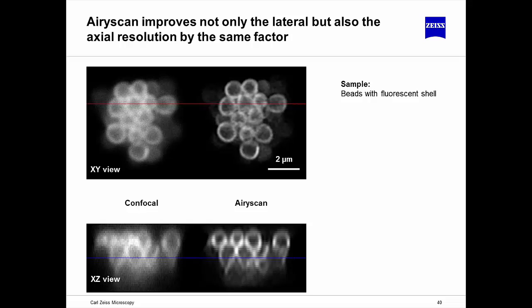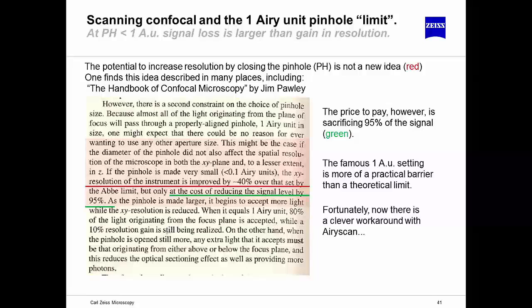Now, how does it work? The main idea behind the Airyscan is what can we get if we close the pinhole? It's no secret that by closing the pinhole, you can increase resolution. So here is an extract from the Jim Pawley handbook, kind of the Bible of modern day microscopy, where the confocal handbook says if you close down the pinhole, you can gain 40% resolution increase.